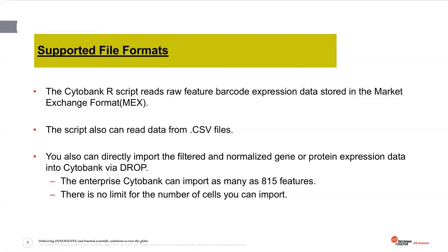And the script can read data from the MEX file format. It also can support CSV files. And here I would like to mention that if you are enterprise Cytobank customers, you can import as many as about 800 features into Cytobank. And if you are premium Cytobank users, you are only allowed to import as many as about 100 features into Cytobank. And there are some workarounds for you to deal with the feature limits for premium users.